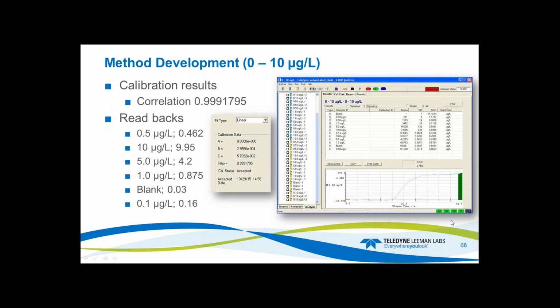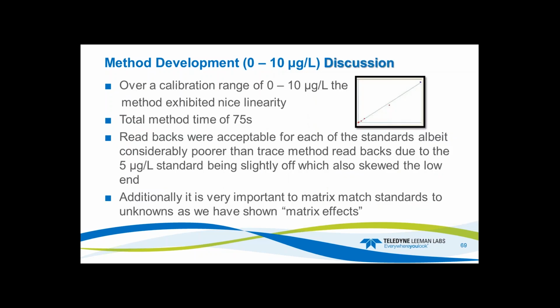So even though you look at the concentration correlation and you see a number, it may or may not give you good results. It may give you decent results. So always the fallback is to strive for at least 4 to 5 nines on any system. Try to get that correlation as close to 1.0 as possible.